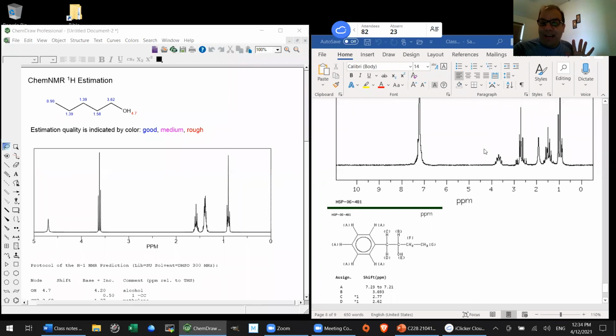That's why, as I said, I always identify the OH protons last. I get everything else first. Everything else is easier to assign, and then whatever's left is my OH. That's generally how I go about it. But this is a case where you've got more complicated splitting than just the N+1 rule would lead us to guess. And that's because you have more than one type of adjacent proton, so you can't just lump them all together. 2 plus 2 is 4, 4 plus 1 is 5. It may not be that simple.